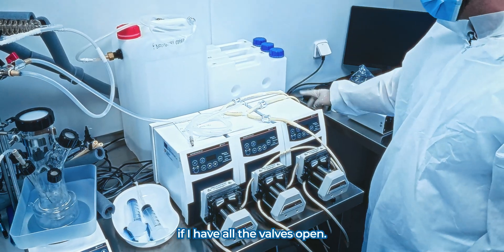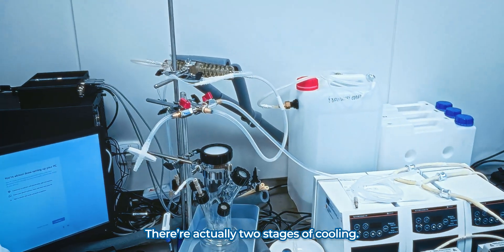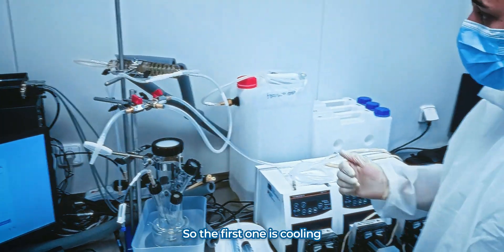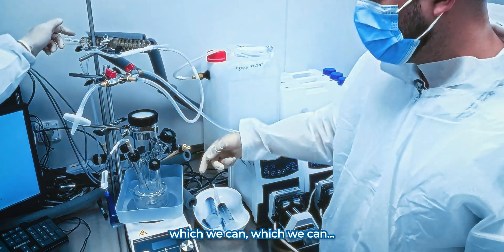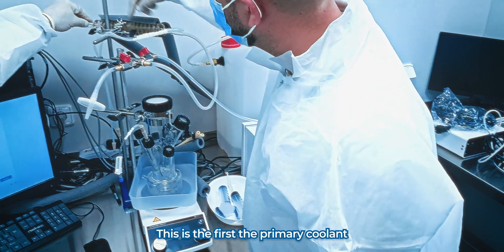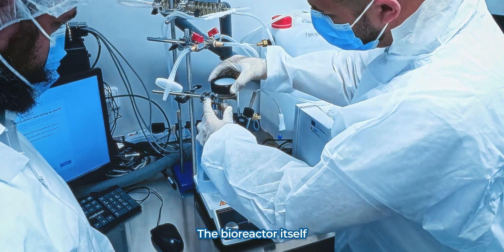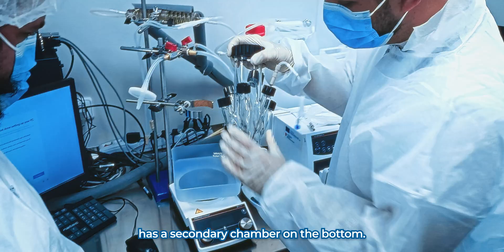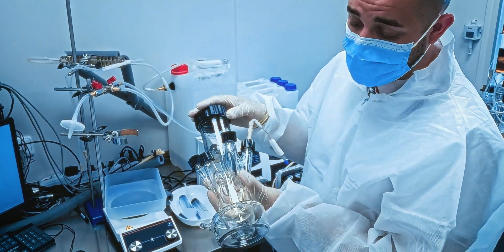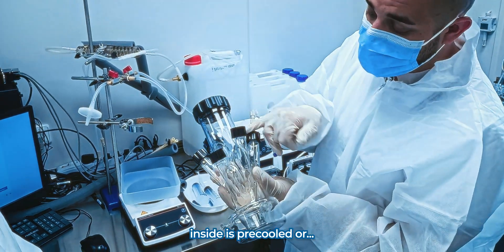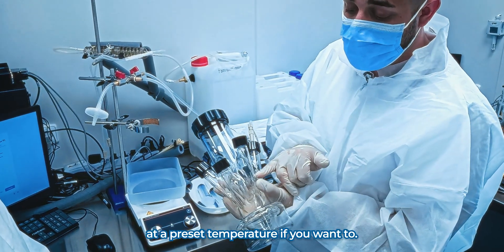There are valves, so we have to check if all the valves are open, then everything is pumped through the system. It's cooled. There are actually two stages of cooling. So the first one is cooling the fluids coming in. And then there's a secondary coolant in here, which is the primary coolant that is cooling the solutions pumping inside. The bioreactor itself has a secondary chamber on the bottom. And this one is pumped with really cold secondary coolant.